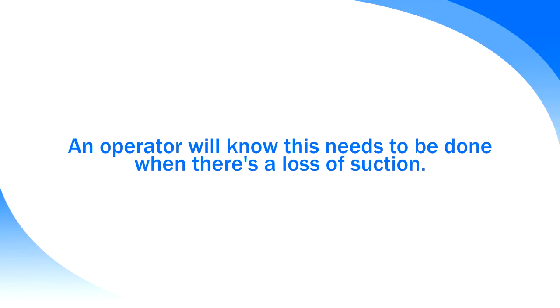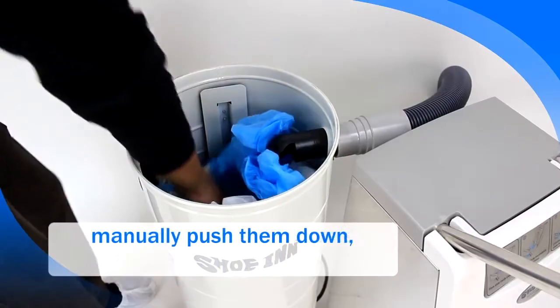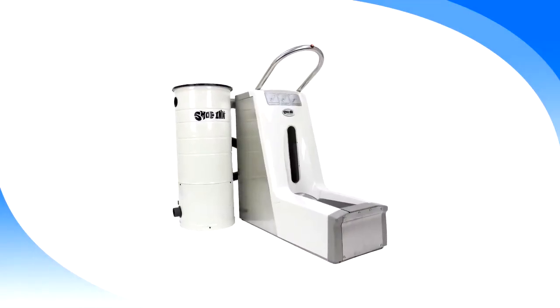An operator will know this needs to be done when there is a loss of suction. To compact the shoe covers, simply lift the lid, manually push them down, and close the lid. The remover is now ready for ongoing use.